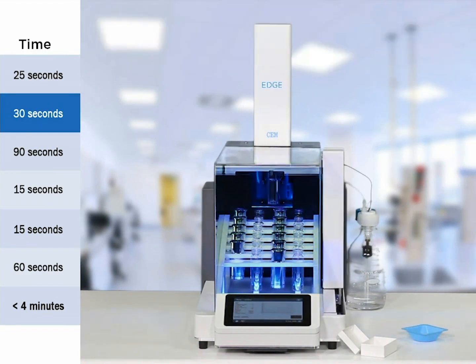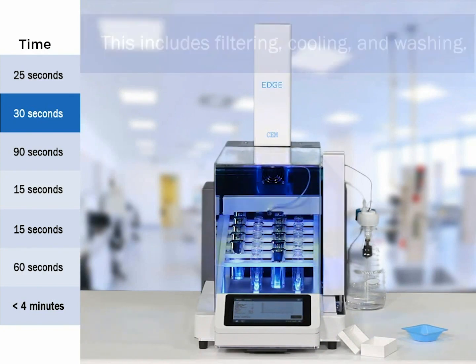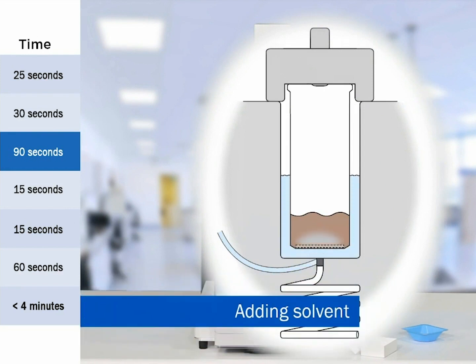The Q cup is then going to be loaded into the chamber. You see the automation taking care of that. And then our pressure seal is going to come down, creating a pressurized environment. This is now a picture of the cross-section of that cell. It's going to add solvent from both the bottom and the top.